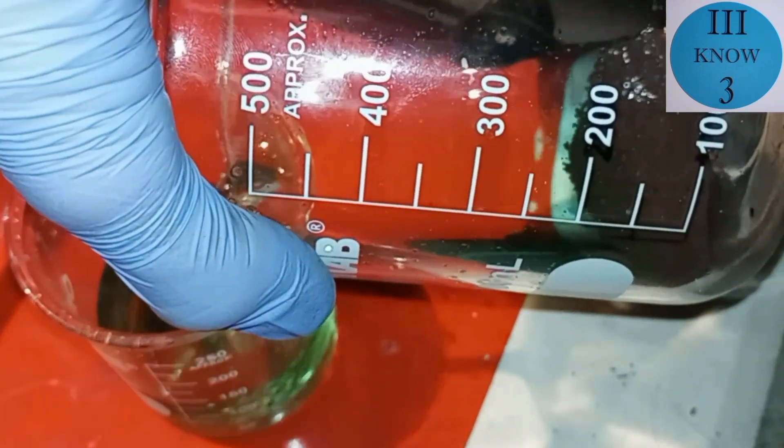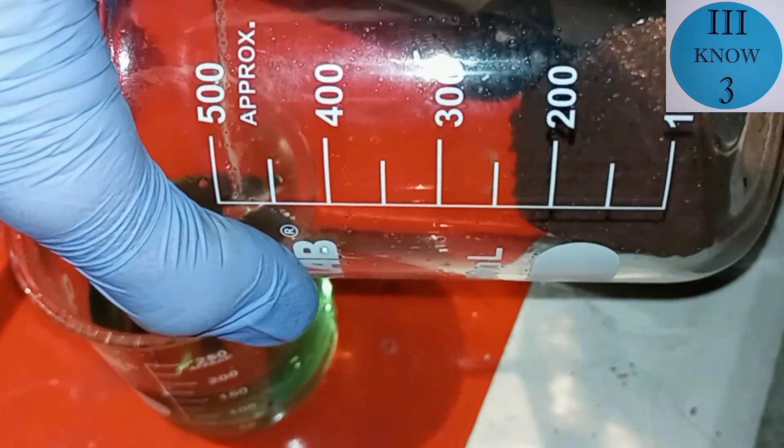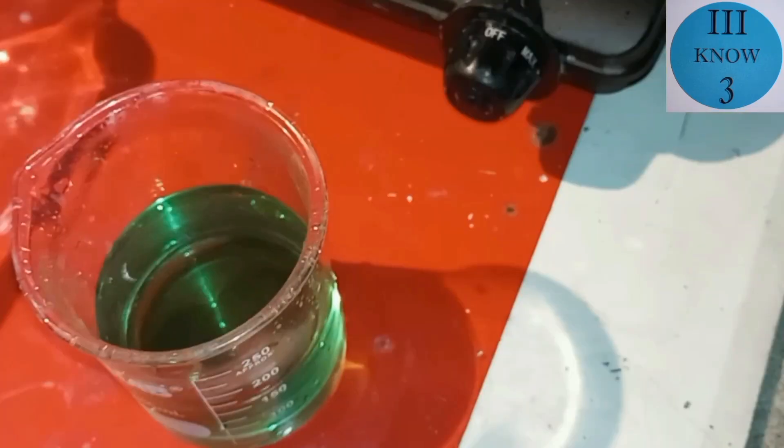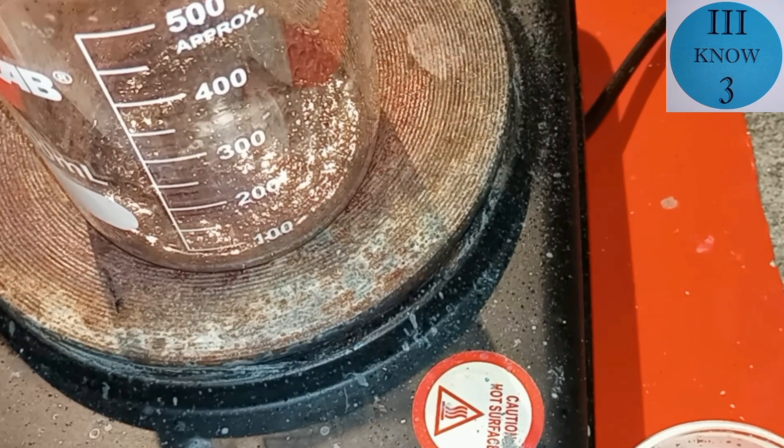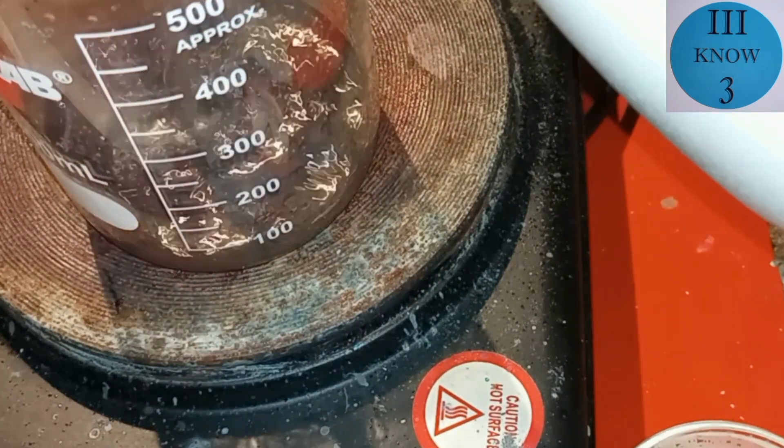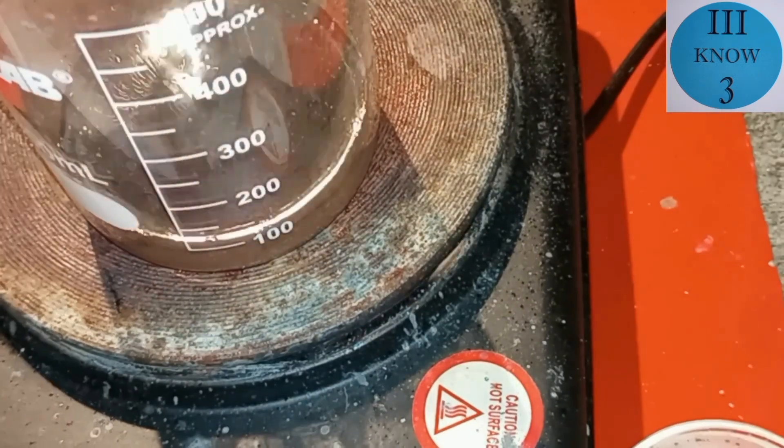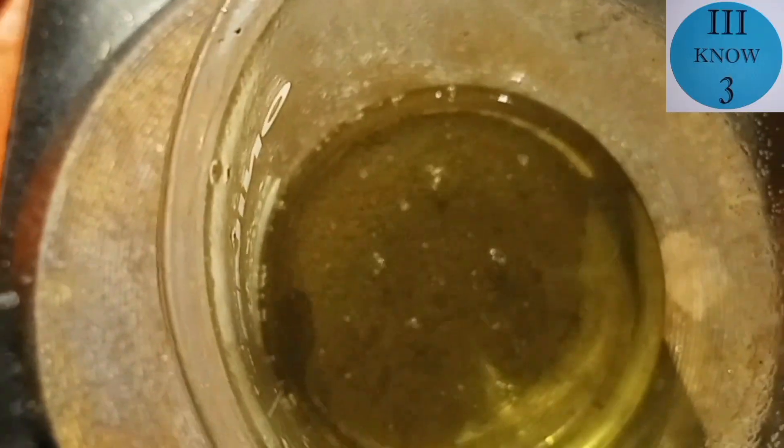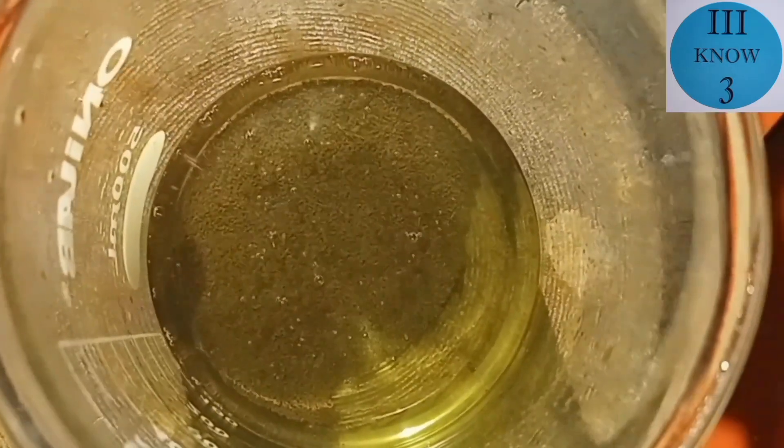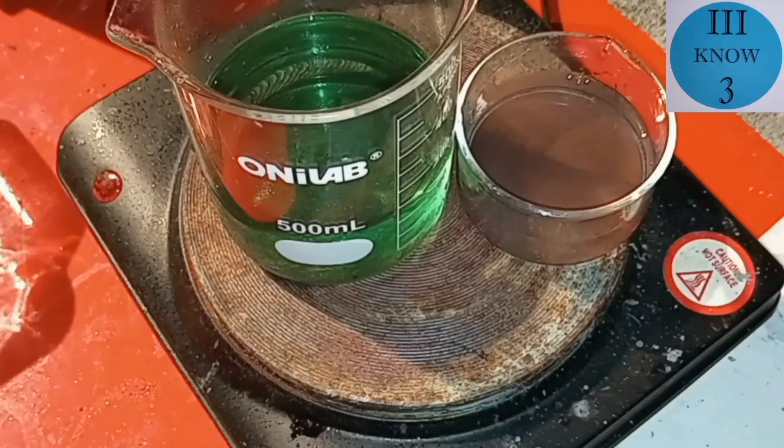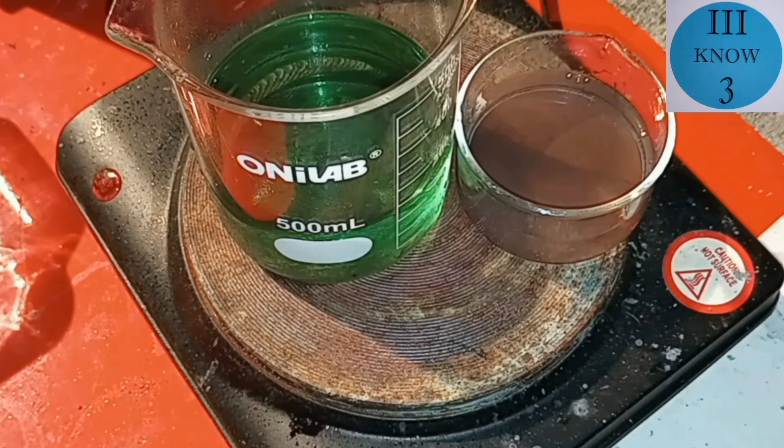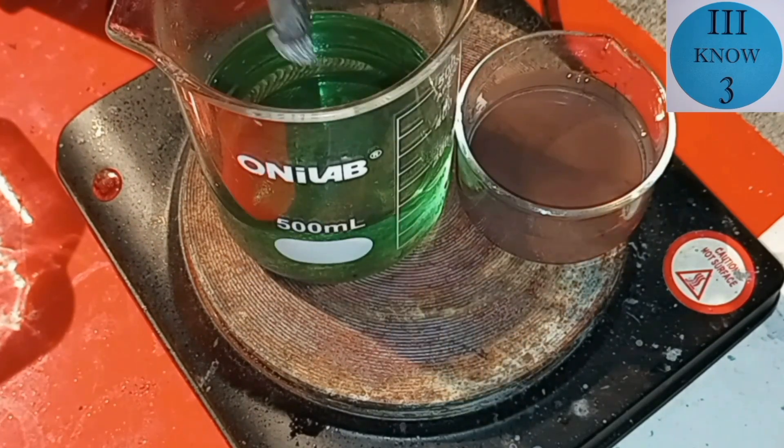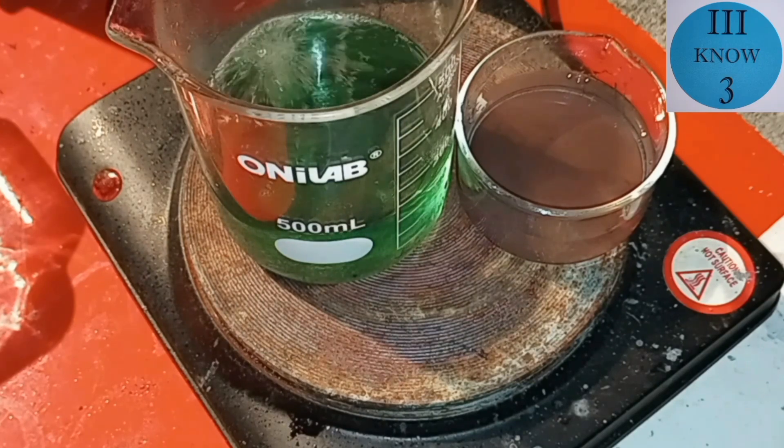So we will drain off the nickel chloride solution and wash the copper. First we'll add a little bit of the hydrochloric acid to see if we can remove any remaining undissolved zinc or nickel. After that we've washed it several times in distilled water and here it is with the nickel chloride.